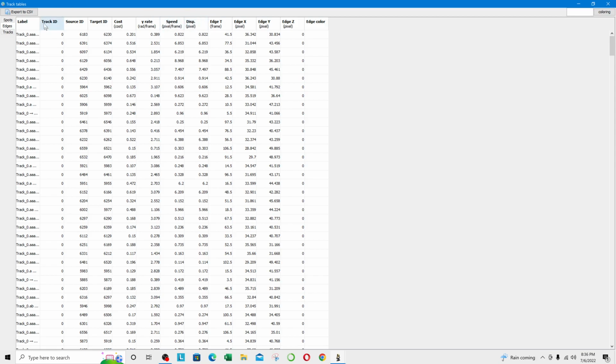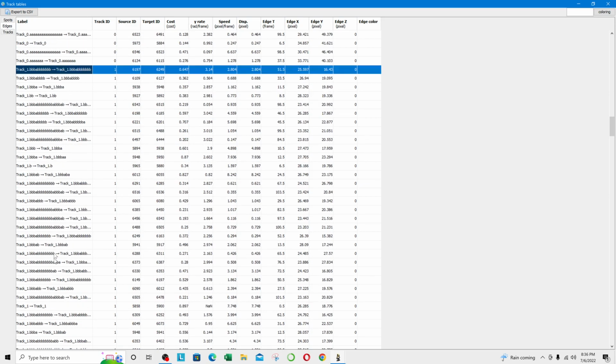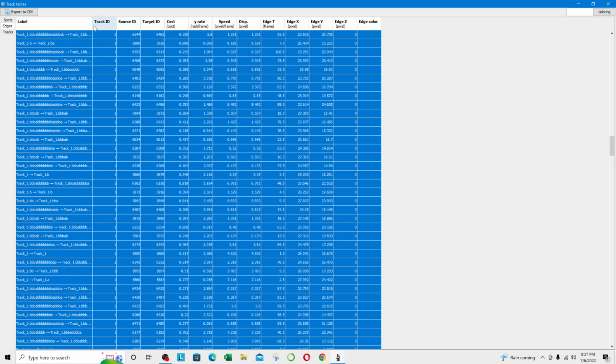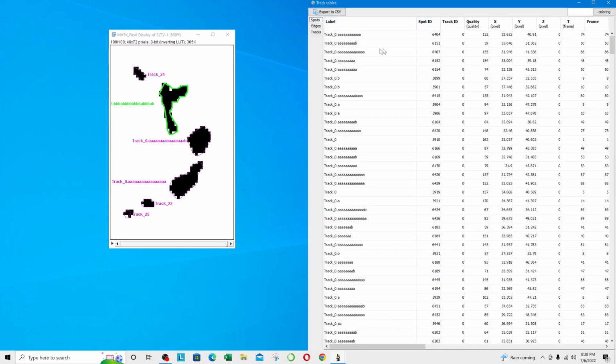So for track 1, you can take all of your track 1 files from here all the way down to wherever the track 1 goes, right there, and you can see all of the displacements for each individual splitting daughter mitochondrion, because it tells you right here all of the splits and the directionality of those splits that are taking place. The other easy thing is that you can export all of this data to a CSV file for any other processing that you want to do.